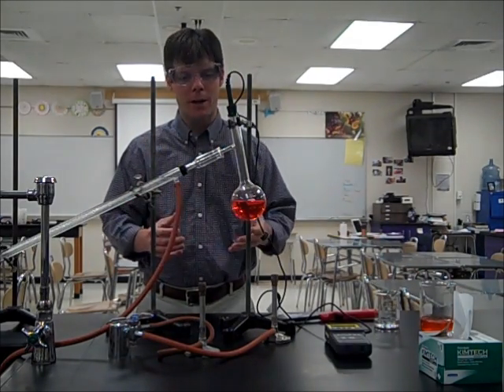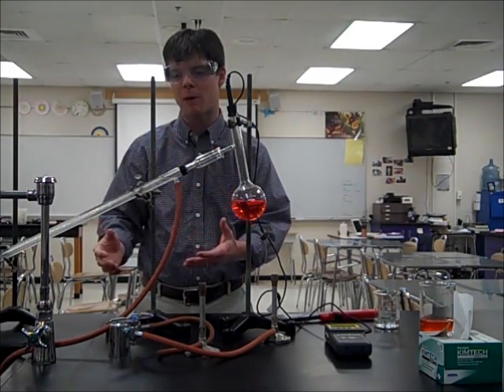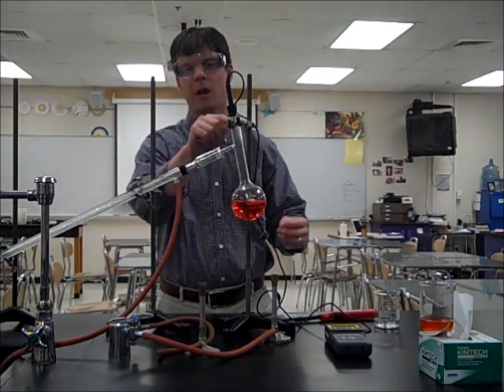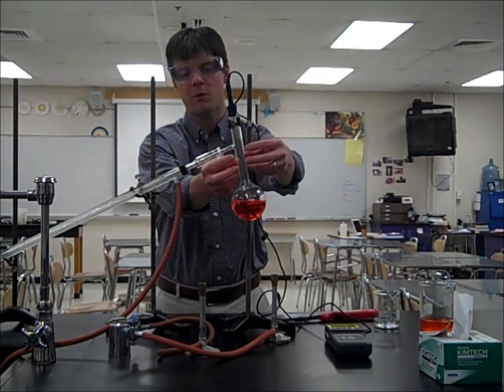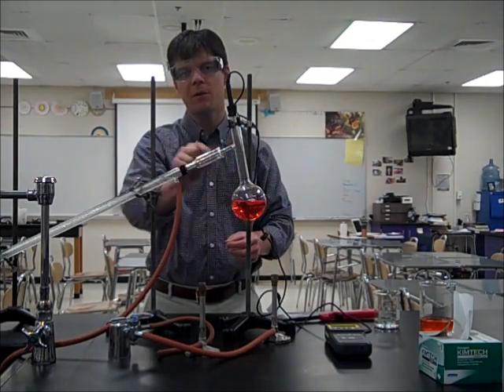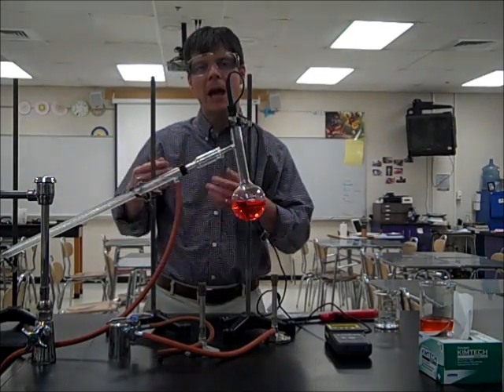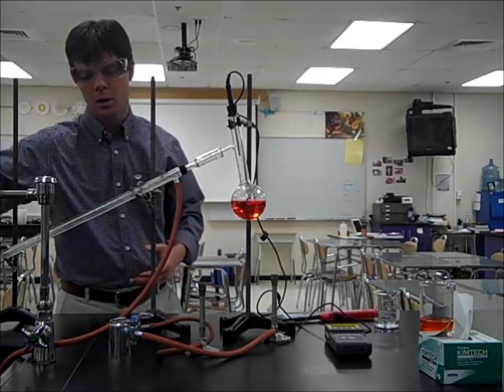In order to take a better look at this process, we need to better understand our distillation apparatus. We have a distillation flask, and you're going to notice I've stoppered this. I also have inserted a probe so that we can measure the temperature of vapors that are going to be generated right here. There's also a tube that comes off the side of the flask which enters into this condenser tube, and the condenser tube has an inlet for water right down here so we have water coming from the sink.